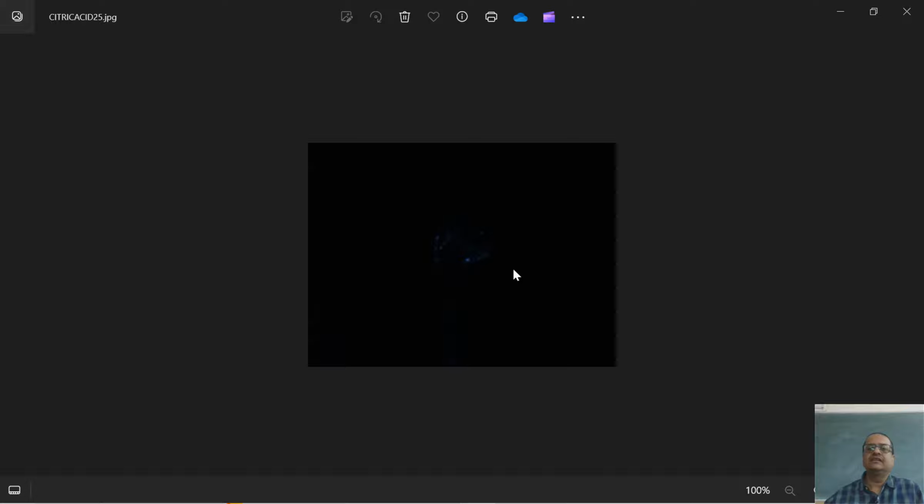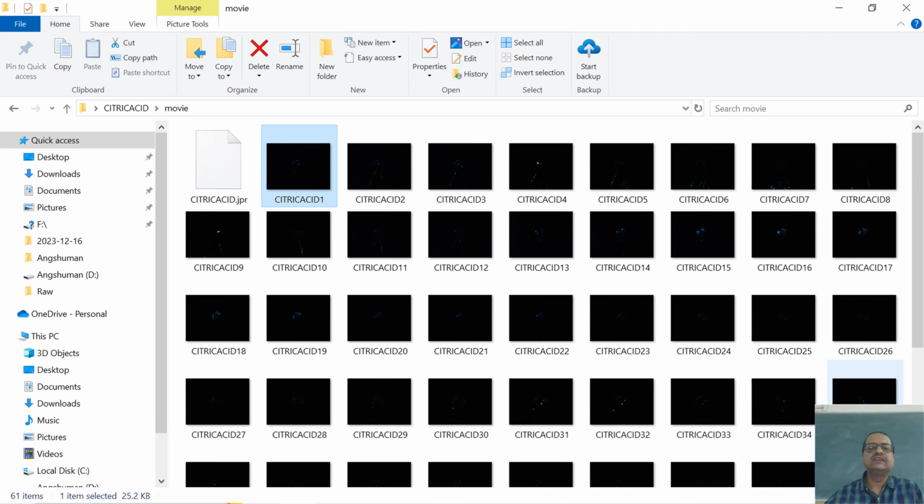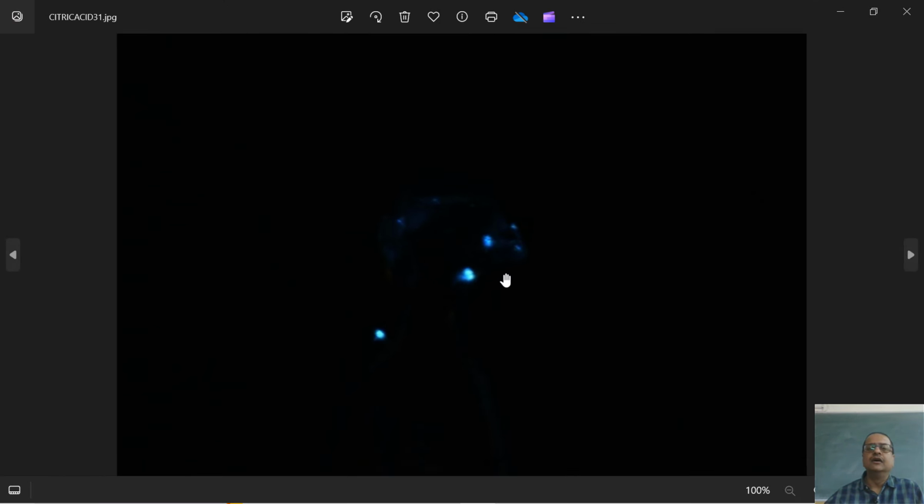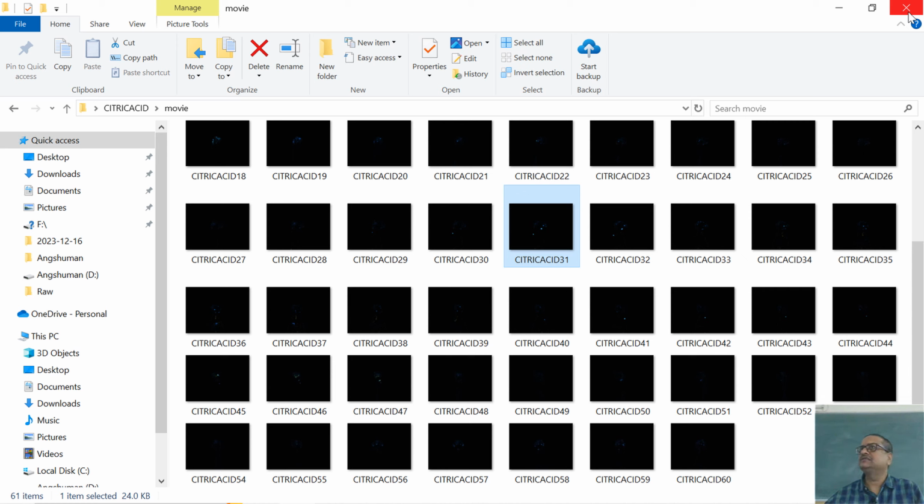So this will give you an idea about the shape and size of the crystal. And at some point one should be able to use it for face indexing also, provided you have light. Face indexing means when you mount a crystal with well-defined faces, then one can identify the HKL values for those individual faces. Okay?